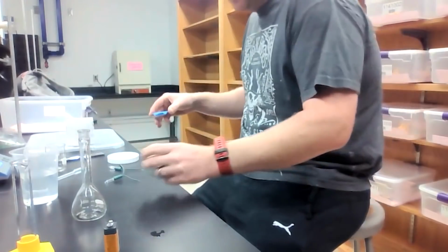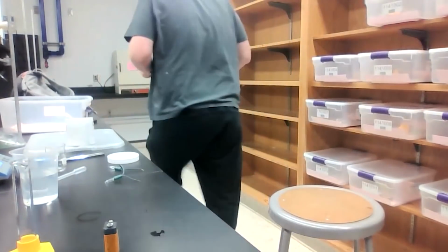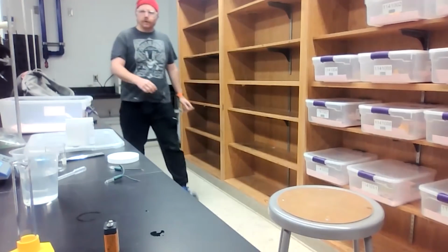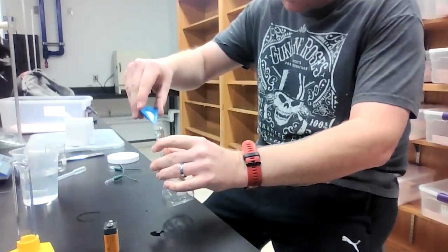I'm going to rinse out my glass and transfer this into there.